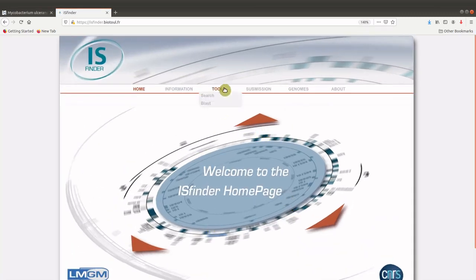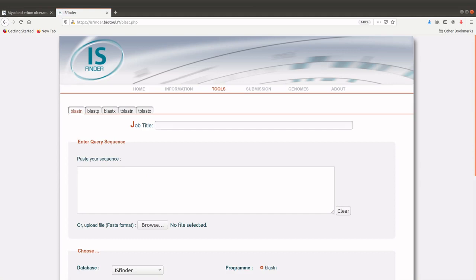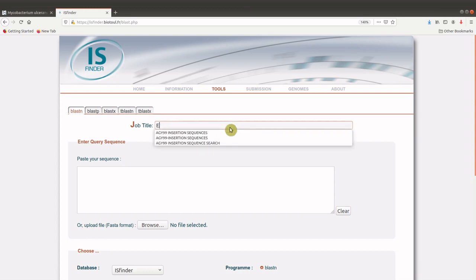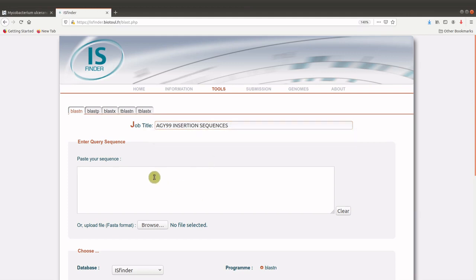So the tool we are going to use is here, BLAST. Once we are there, we can begin by giving the job title. It's just for records, but you can leave it as well.